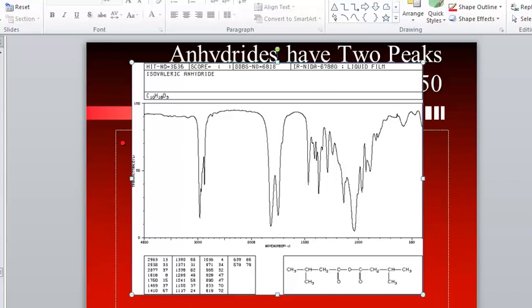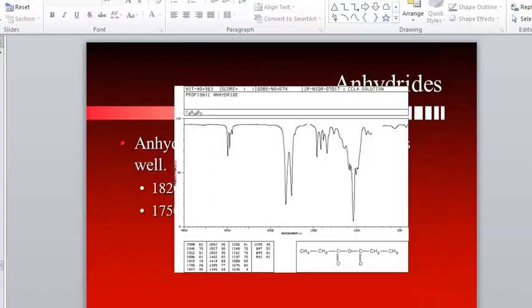All right. So a lot of times some people find anhydrides very easy to pick out. Carbonyl is one of those main bonds that we look for at 17. They're already comfortable with that number, and if they see something else that's really close, like this one was, to that 1700 peak, then they will automatically pick it up. All right. Now the difference here, that is a double peak, 17 and 1800.